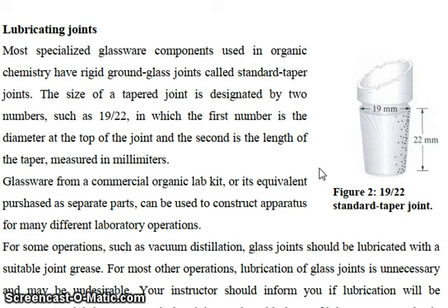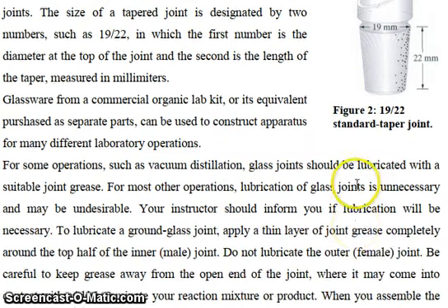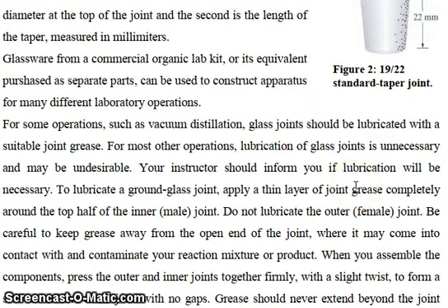Glassware from a commercial organic lab kit or its equivalent purchased as separate parts can be used to construct apparatus for many different laboratory operations. For some operations such as vacuum distillations, glass joints should be lubricated with a suitable joint grease. For most other operations, lubrication of glass joints is unnecessary and may be undesirable. Your instructor should inform you if lubricant will be necessary.